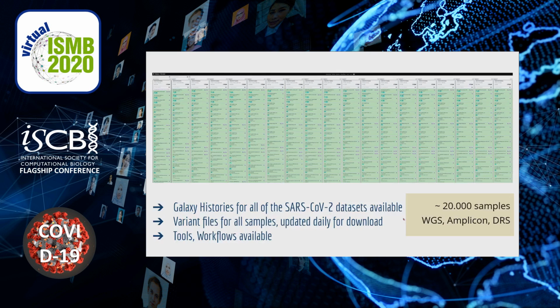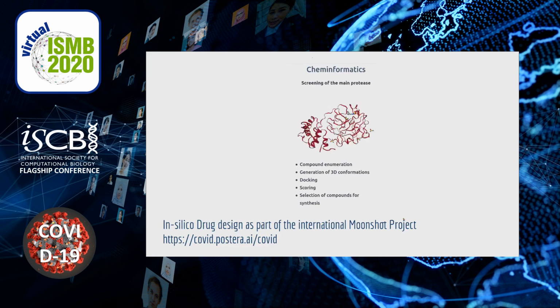This entire setup not only works for whole genome sequences, but for example, if you have amplicon data, we have a specific amplicon workflow, for example, for the ARTIC protocol, that you can treat in the same way as the variant workflow.